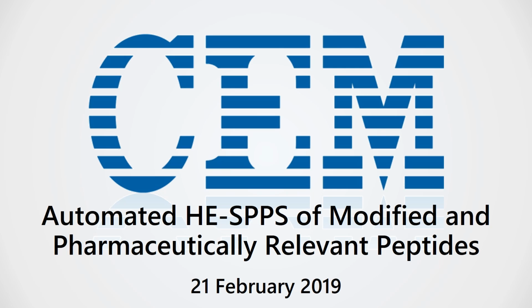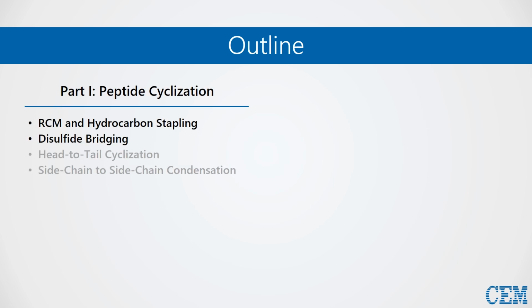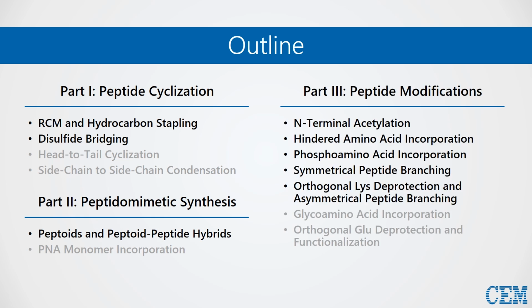Hi everyone. Thank you for joining me in this webinar on the automated high-efficiency solid-phase peptide synthesis of modified and pharmaceutically relevant peptides. In today's webinar, we are going to cover the variety of synthetic applications possible with the Liberty Blue automated microwave synthesizer. We will cover the methods of peptide cyclization, peptidomimetic synthesis, and peptide modifications displayed in this outline.